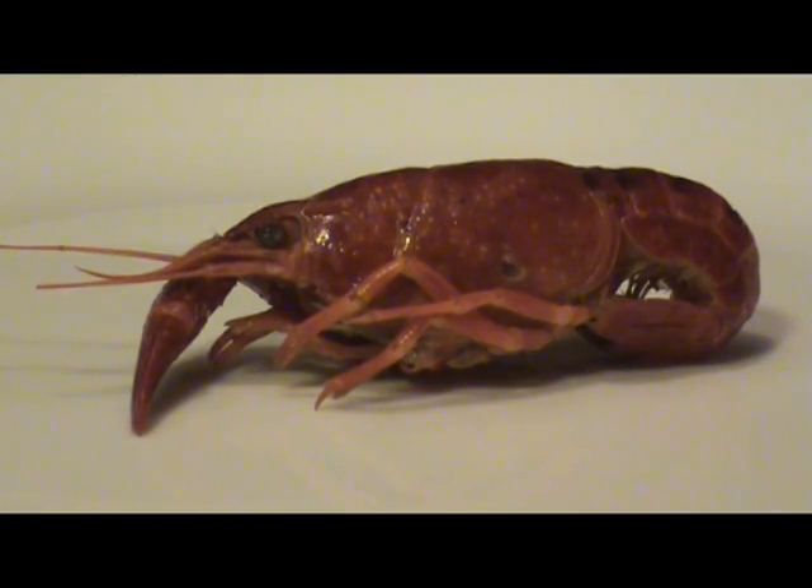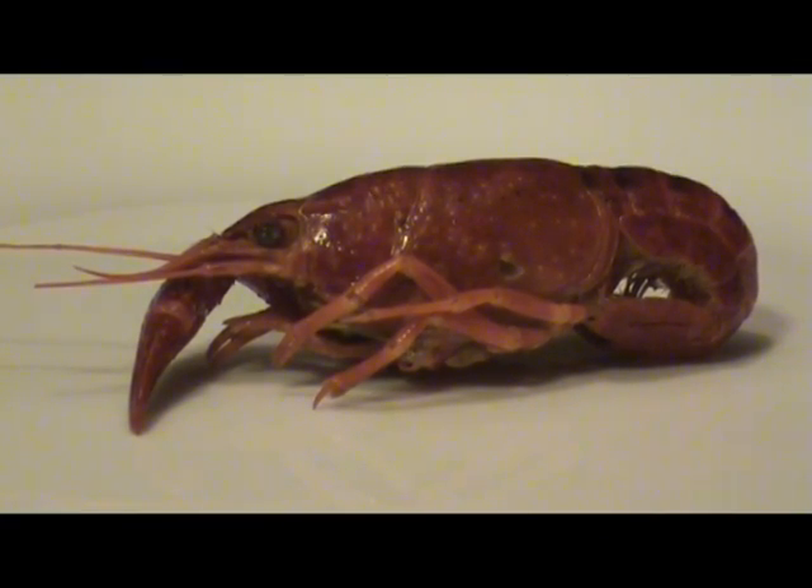Welcome to lesson 2.05, our Crabby Crustaceans Lab. It's about doing a body mapping activity of a crawfish. Your options for this lesson are to do a body mapping of a crab, shrimp, lobster, or crawfish. Let's go ahead and get started.